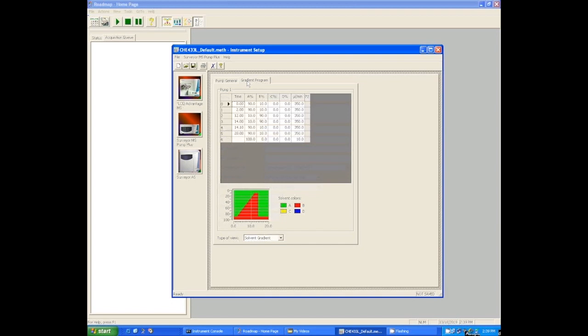and you quit there and you tell it to start the next run, it'll try and jump immediately down to 90 percent A, 10 percent B, and it won't make it. So your next run will start and you'll have a weird mixture of solvent. So you have to do what we call re-equilibrate, which is program a time at the end of each run where you just tell the instrument to go back to the beginning and wait there for five minutes to prepare for the next run.